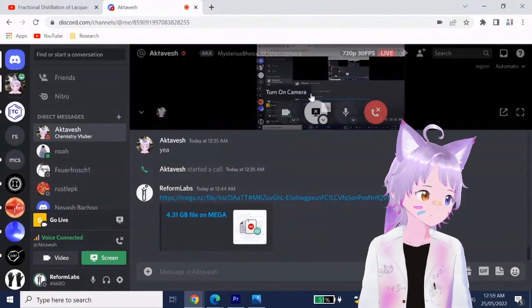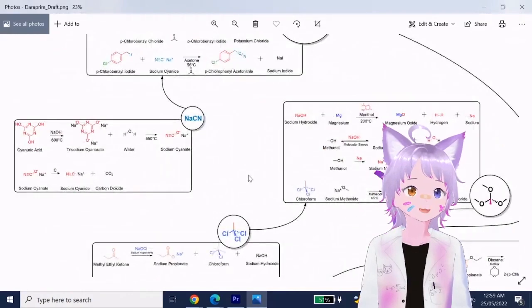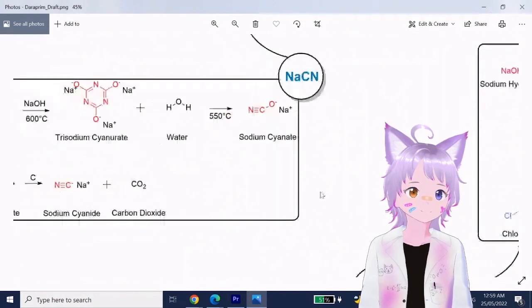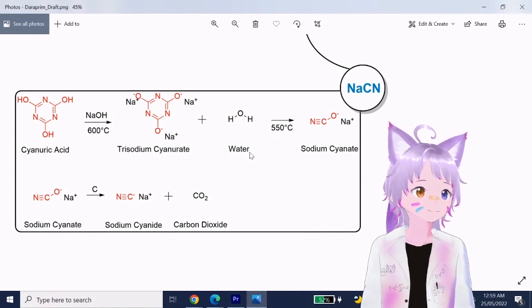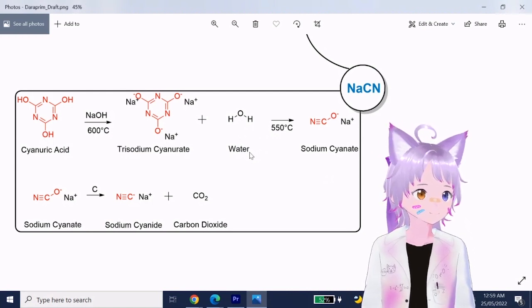But let's not mess with cyanide if we don't have to. I mean, we can try the synthesis and we can even try his method and maybe improve it. Maybe we can salt it out more. I don't know. But I honestly think there might be some other impurities in his cyanide, maybe from the cyanuric acid, because I know that cyanuric acid can sometimes form other byproducts when you pyrolyze it.